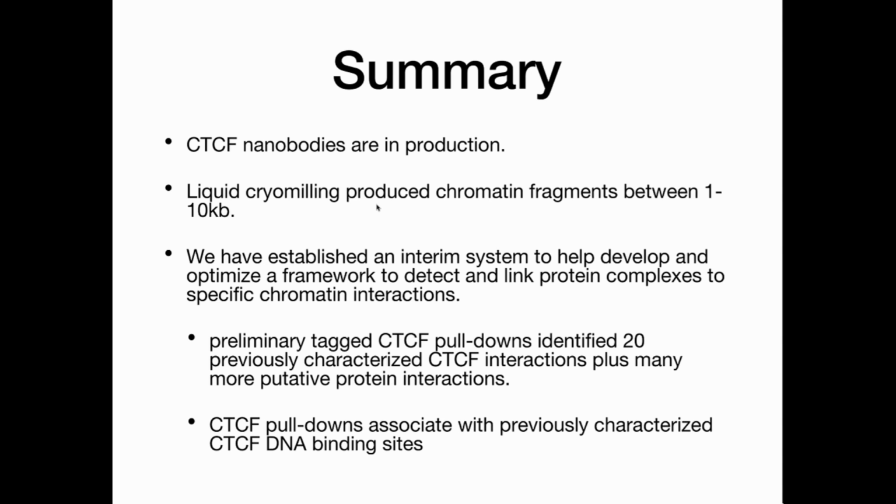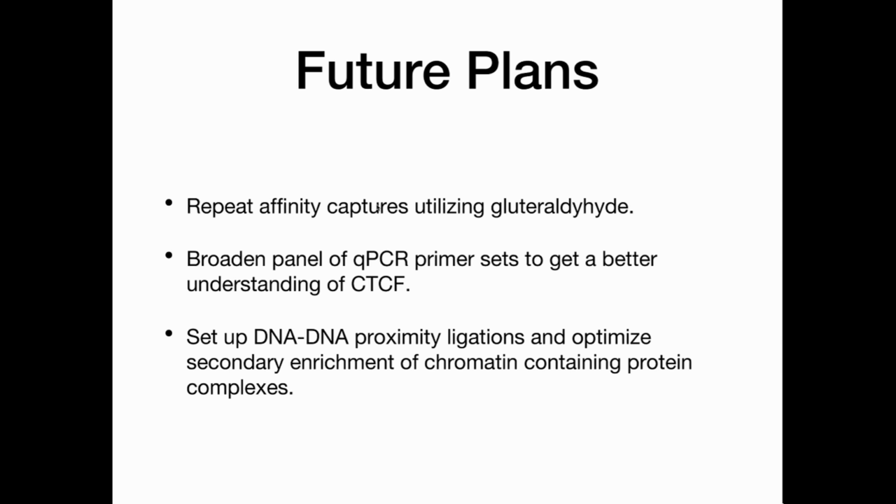DNA binding sites. Our future plans are to repeat these affinity captures utilizing cross-linking agents such as glutaraldehyde or formaldehyde. We want to broaden the panel of qPCR primer sets to get a better understanding of CTCF, or maybe even do a deep sequence. We want to set up some DNA-DNA proximity ligations to optimize secondary enrichment of chromatin-containing protein complexes.